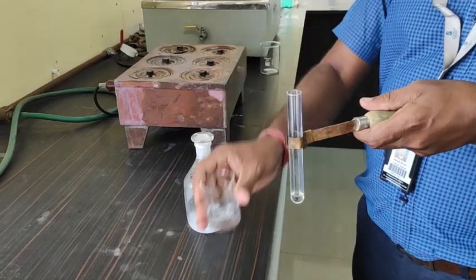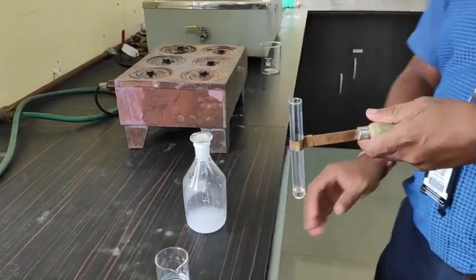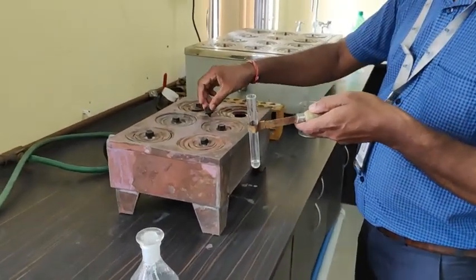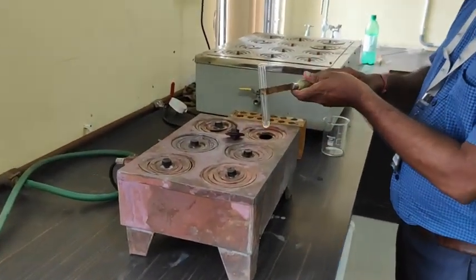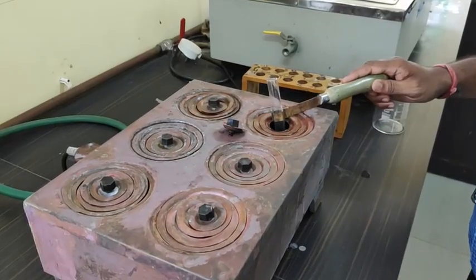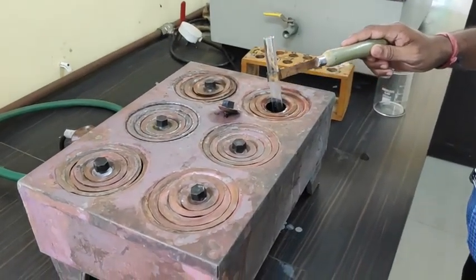Now he is adding it drop by drop. Around 2 ml of sodium hydroxide has been added. Now what we are going to do is to boil it. Now we need to do it for a minute. I have paused the video for some time.